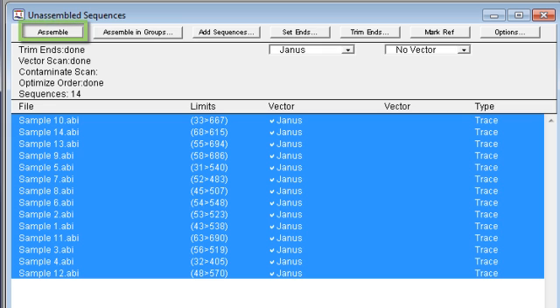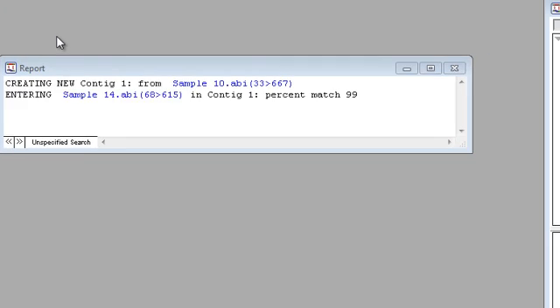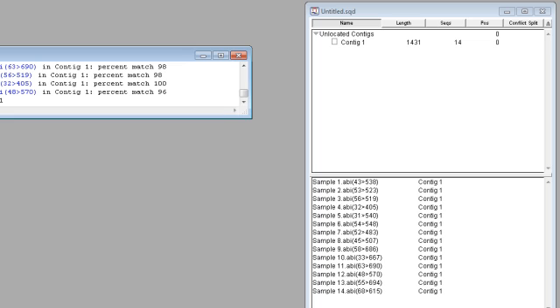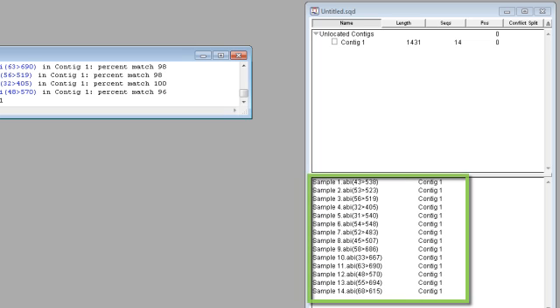Now I'm going to assemble my sequences simply by clicking the Assemble button. And here you can see SeqMan Pro has created a single contig with all 14 sequences.